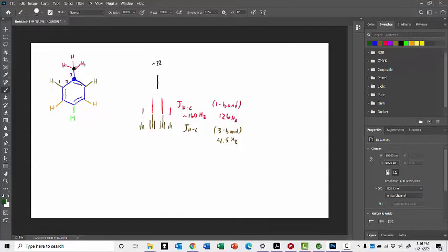So this hydrogen right here is going to be 2 bonds away from the blue dot. Likewise, you would expect this to be 2 bonds away, 1 bond there, 2 bonds there, and then this hydrogen out here you would expect to be 3 bonds away, 1, 2, 3. This blue carbon has 3 hydrogens that are 2 bonds away, plus another 2 hydrogens that are 2 bonds away, plus another 2 hydrogens that are 3 bonds away. So how many neighbors does he have? Well, he has 5 neighbors that are within 2 bonds of him, and another 2 neighbors that are 3 bonds away beyond that.